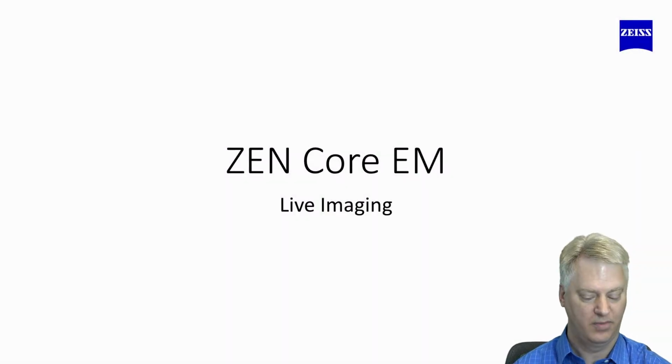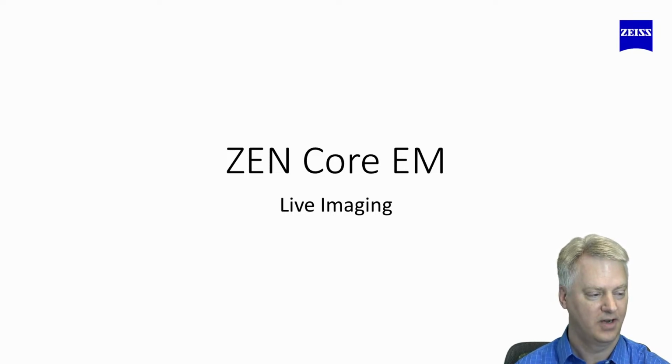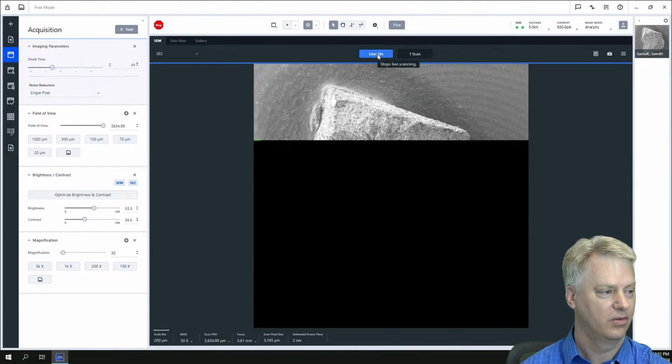One thing I want to note is that a few weeks ago we showed one of these sessions demonstrating the use of our ZenConnect product, which allows correlation between light microscope and electron microscope imaging, so that you can identify where your areas are at the macro scale in the LM images, and then identify and zoom in on them with the electron microscope. Because that's a critical step, I wanted to go back through that first in the workflow. So I'm going to show that first.